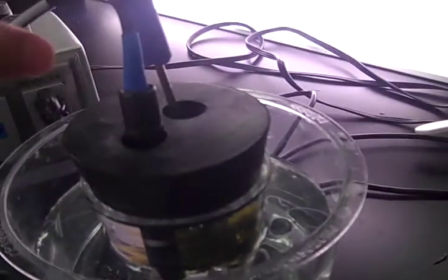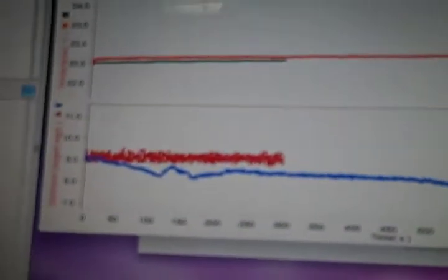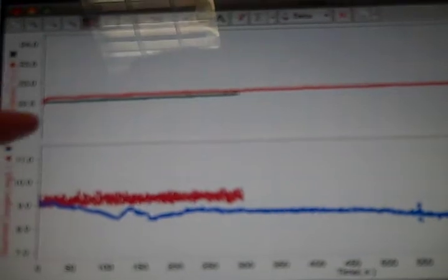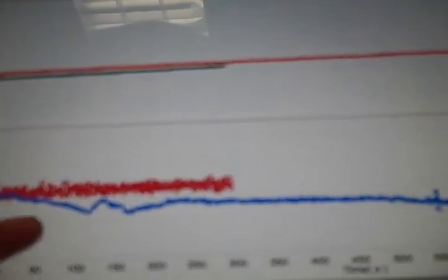I'm Matt, and I'm Brian. The purpose of this experiment is to find the factors that can affect the rate of oxygen production in photosynthesis. Here's the equipment we used in the lab. We have two containers, both filled with water, and we have two probes — one measuring temperature, the other measuring oxygen levels. The data we collect is sent to the GLX, which then sends it to the computer to a program called Data Studio, which puts the data into two graphs. The top graph is for temperature levels, the green one being without the elodia and the orange one being with the elodia. On the bottom is the oxygen levels, the red one being without elodia and the blue one being with elodia. Our group predicted that oxygen levels would increase.